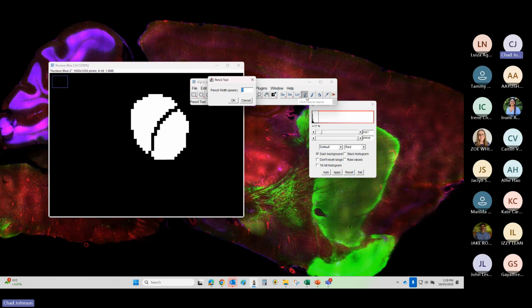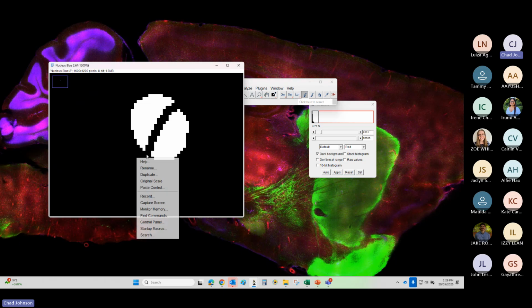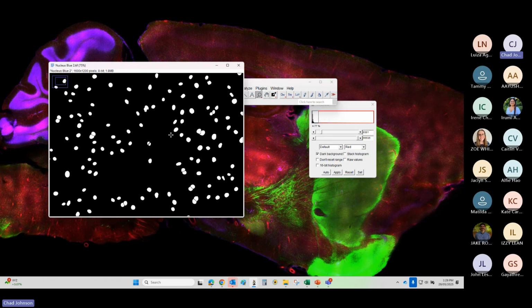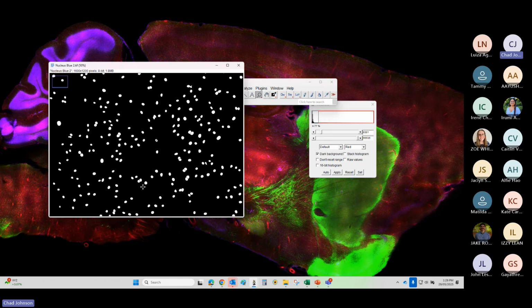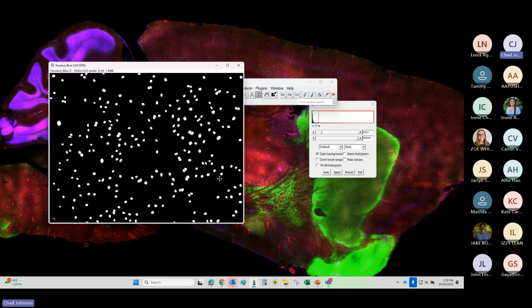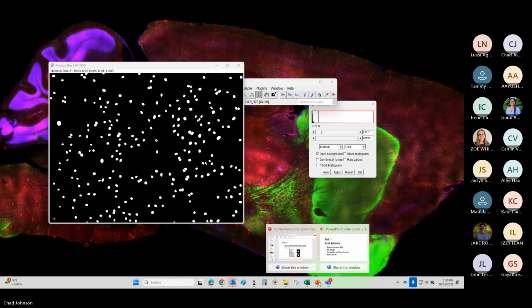So at least double clicking on there, on the pencil tool, make it at least a 2, and that will actually give you a bit more width to then segment that out specifically. Now, hopefully it doesn't come to that. If you've done your thresholding right, it should be okay. When we move to AI segmentation, it gets a lot easier. But if you're doing this sort of watershed type segmentation, it's a bit more troublesome.